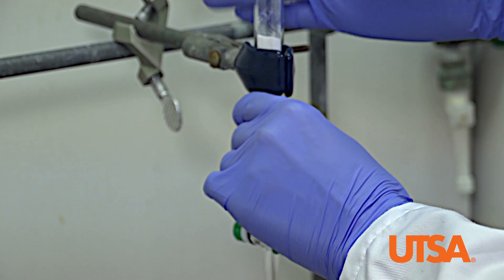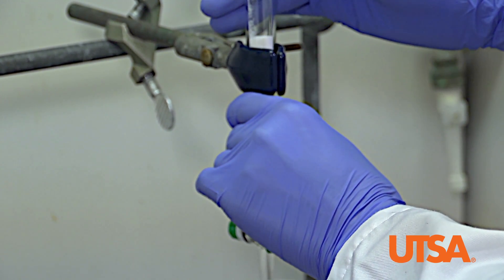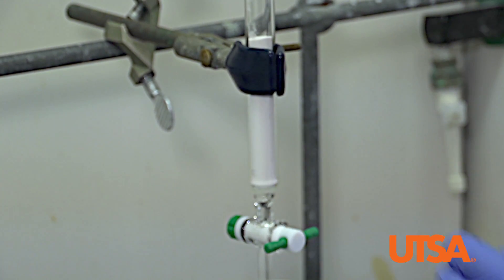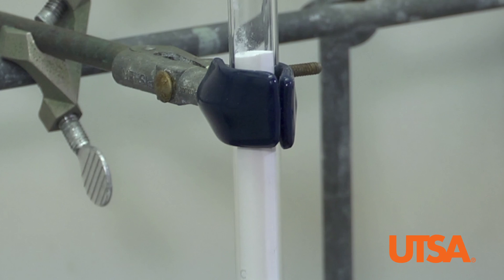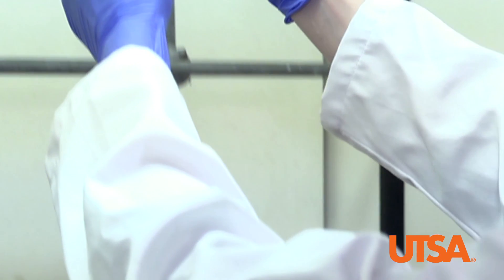Tap the column to make sure that the alumina lies flat. Next, we will add one centimeter of sand to the top of the alumina.